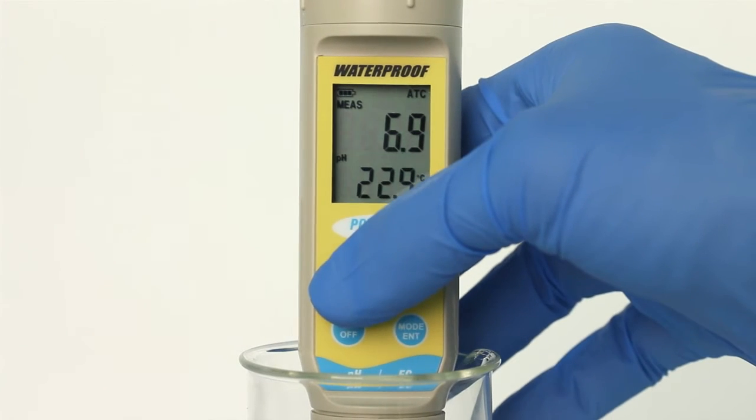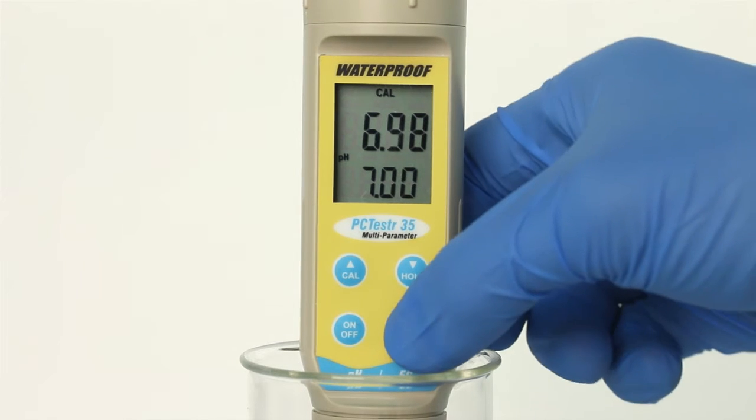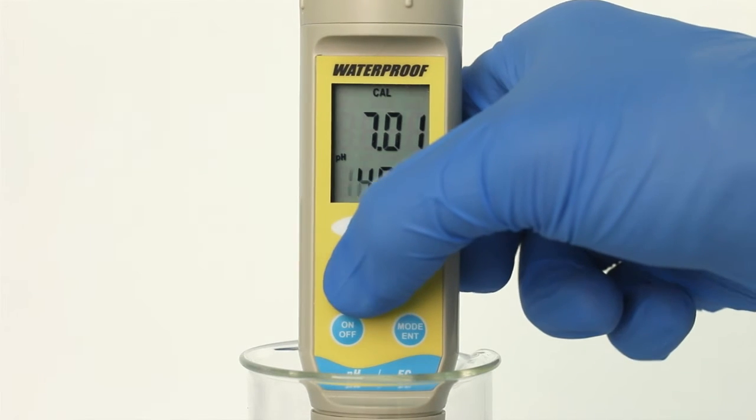The primary display will show the uncalibrated pH value, while the secondary display should search for and lock on the closest automatic calibration value. Allow the primary display to stabilize, then press MODE ENTER to confirm the calibration value. The primary value will blink briefly before the secondary value automatically scrolls through the remaining pH buffers available for calibration. Repeat with additional buffers or press CAL to return to measurement mode.